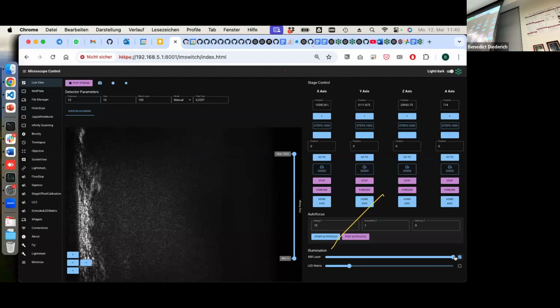So look up the diagram, then we try to convert that into a cubified system, so that you know, okay, this has to go there, and then we can maybe discuss what's missing and how you will do that. But in the end, it's not so difficult. Okay, so then go out and do stuff. And in the meantime, I'll try to align stuff here.